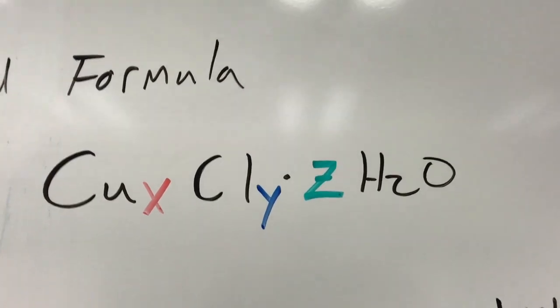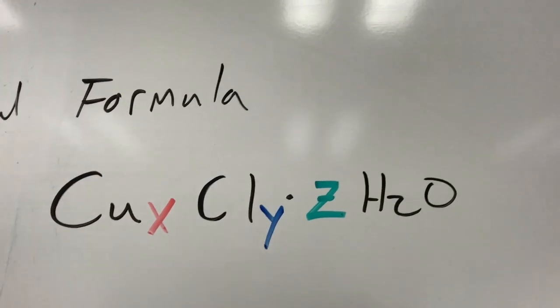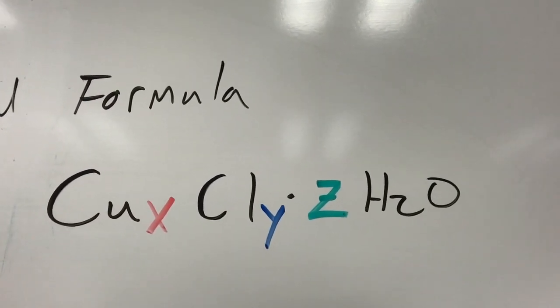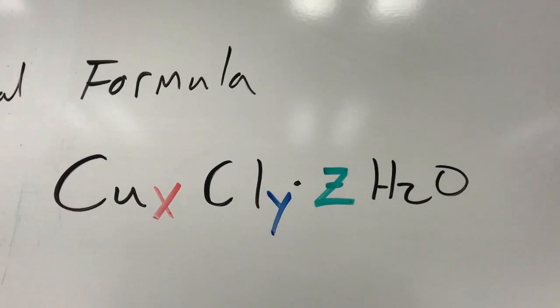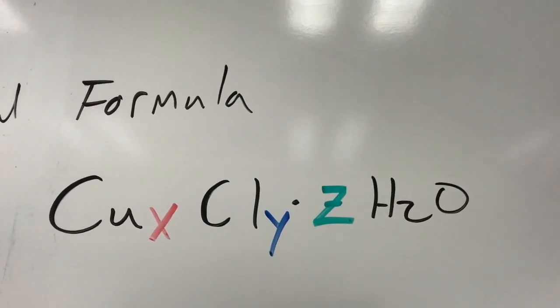Today we're going to walk through the steps of determining the chemical formula for the hydrate, copper chloride hydrate. Now the X, Y, and Z all represent values that you're going to determine experimentally. So I'm going to walk through the steps and then we're going to go ahead and actually film the process of the lab.